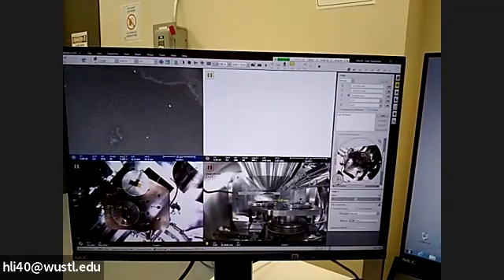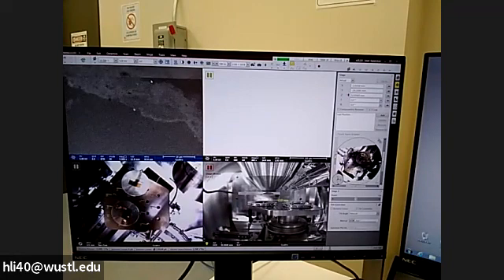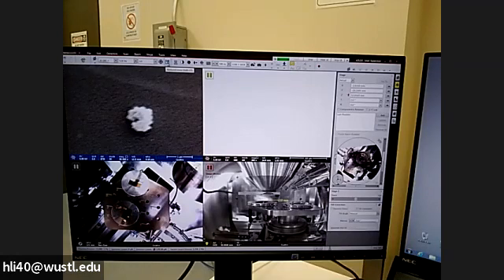Okay, so for example, what you see here, I see a particle. If I move to the screen center, if I zoom in, you see it's kind of blurred out. This is out of focus. To bring it in focus, we adjust focus now. Okay, you will see it become cleaner and cleaner. You will see some morphology there. Okay, this is the focus. I'm going to zoom in a little bit more so you can see better. It's a good example here.